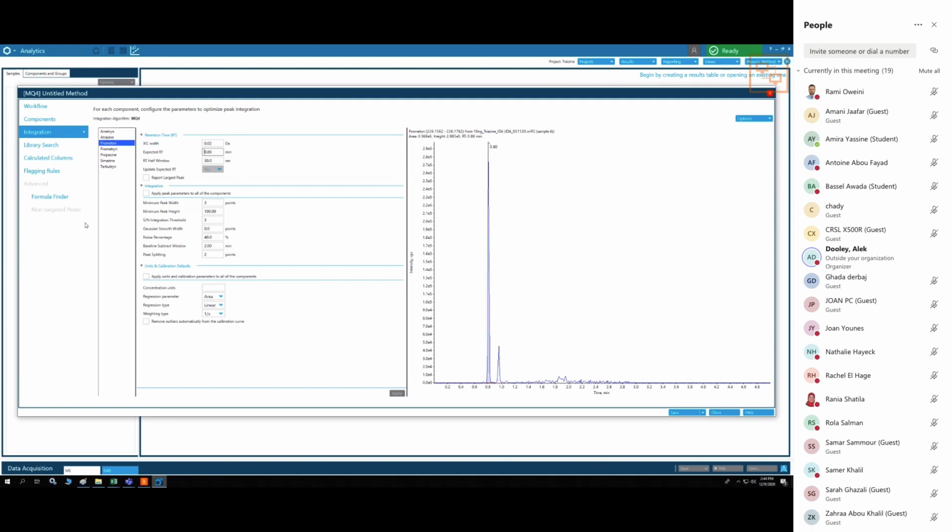Now you have a couple of interesting settings about retention time. You have a search window. This RT half window means how wide a window the software will search for the compound in. 30 seconds is half the window, right? Keep in mind it says RT half window. It will be centered on 0.8.